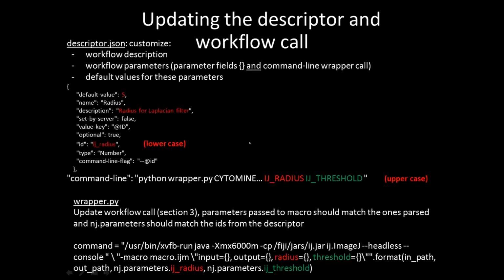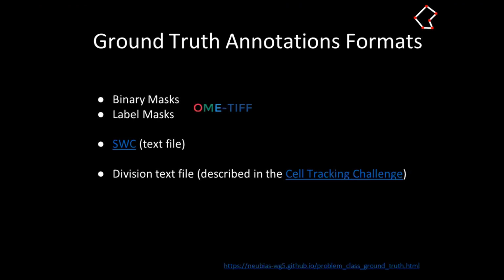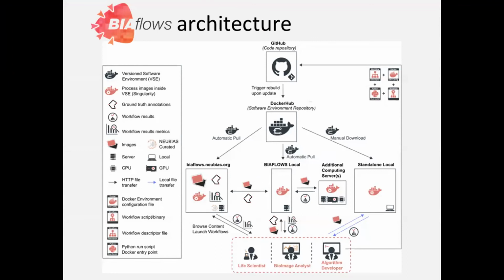Yeah, maybe about this, a quick comment showing it from a slide. I think it's easier. So if I go back to the whole architecture of BIAFLOWS, because we haven't commented on this slide actually. So this part now I'm sure you're quite familiar with, but this part has not been completely described.